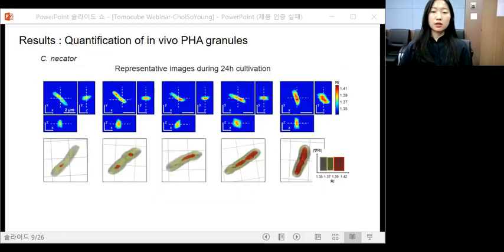After identification of in vivo PHA granule, the quantitative analysis was conducted. To understand the formation and growth of PHA granules, the C. necator cells were cultured for 24 hours to reach their maximum PHA accumulation and subjected to ODT analysis at 8-hour intervals. These are the representative images during the 24-hour cultivations.